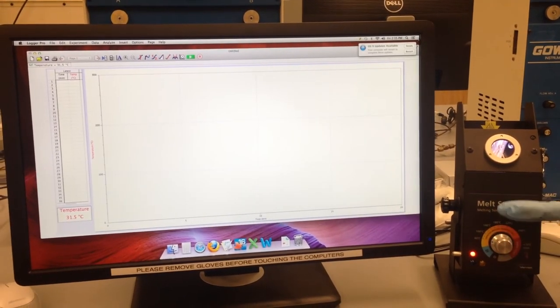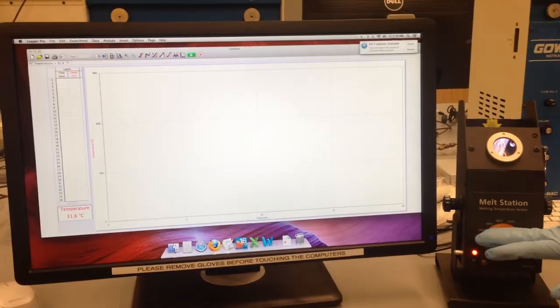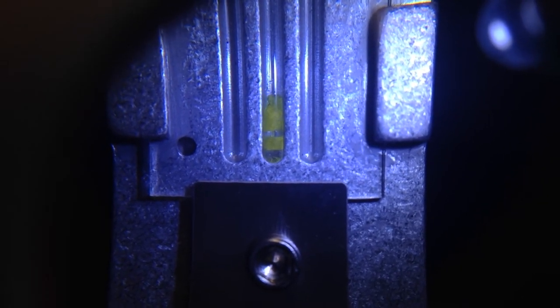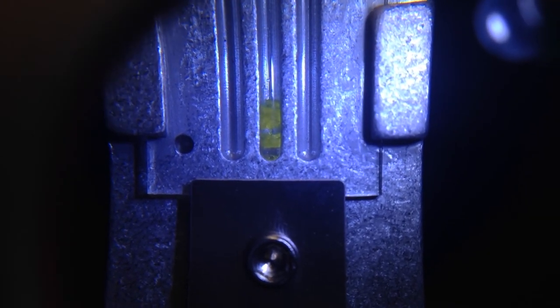Turn off the meltemp between trials so that it can cool down. Watch until you see the sample start to melt. Record the range from when it begins to melt till it's completely liquid.